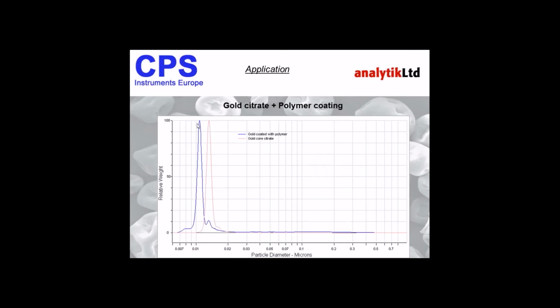You probably look at this and say, well, how can a coated sample of nanoparticle be smaller in size than the core? Well, it's quite simple. We have to remember the calculation of the position of the peak is done by entering the particle density. We're using a density of gold. So this blue trace is not a true density value. It's a core with the polymer coating. And so this position is incorrect. If we knew the density of the combined core coated particle, we could reposition that by recalculating the data.